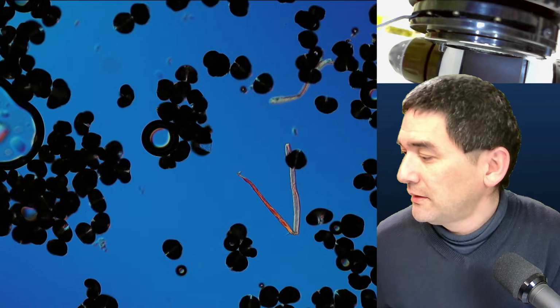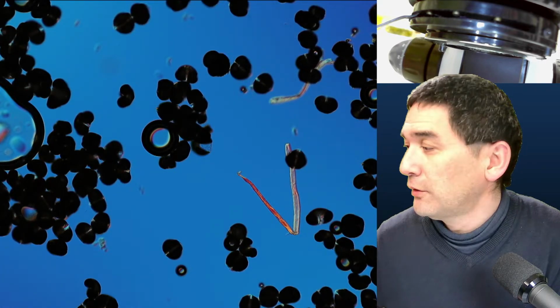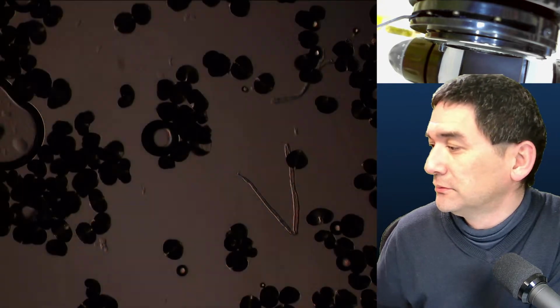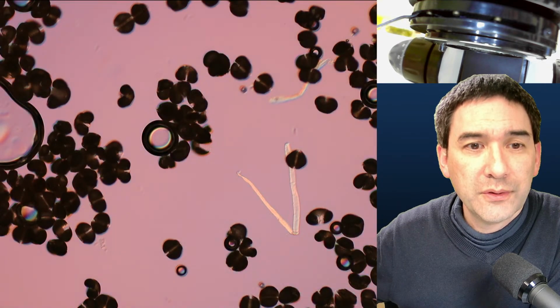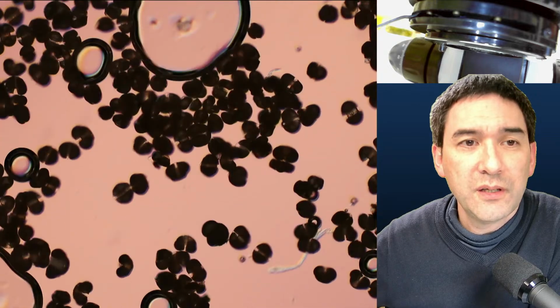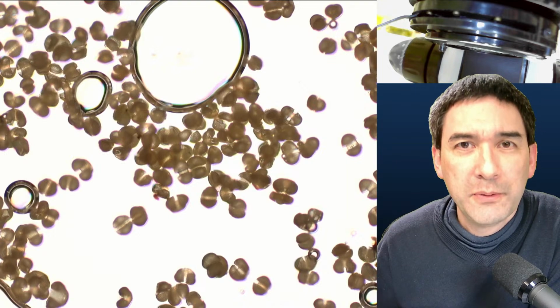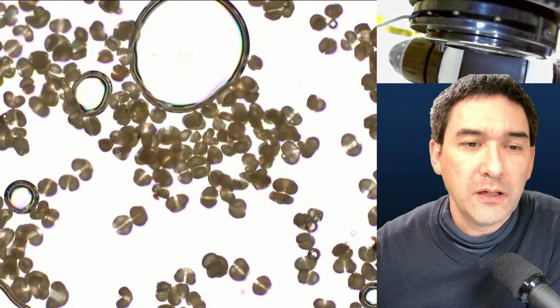Okay, and let's open it a little bit. I can of course change the appearance here, but you see that the pollen grains look kind of dark on a brighter background. And the reason is that, at least for this technique, I have to turn up the light, and then it becomes a little bit transparent. The pollen do absorb quite a bit of light. Okay, so this is at least how they look.